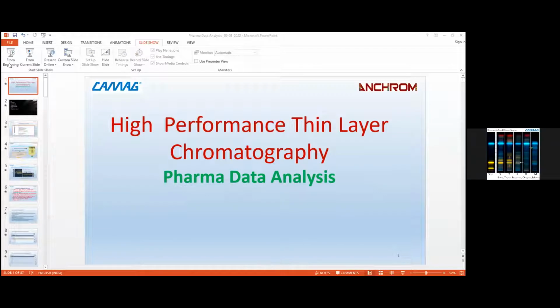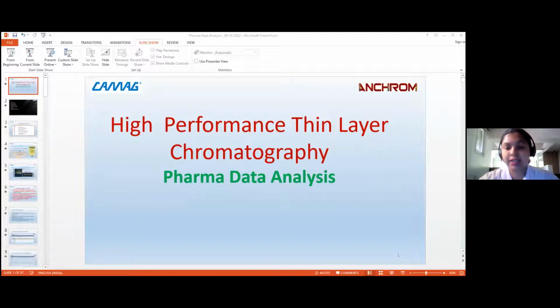Okay, thank you. So today's topic is about HPTLC instrumentation and its data interpretation in pharma applications. This webinar is specially designed for the Zoom and Google platform. Now, before going to the application, let's brush up our knowledge with the basics of HPTLC and TLC instrumentation. First, I will start with the evolution, how HPTLC has evolved from TLC to instrumental TLC, and now the generation has changed. All the instruments are going to be robotic. At the end of this presentation, we are going to see how robotic HPTLC will work in future.